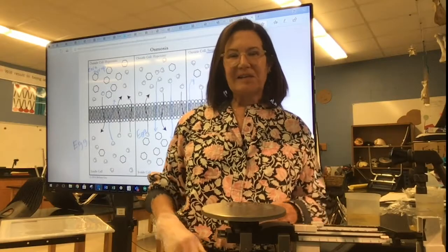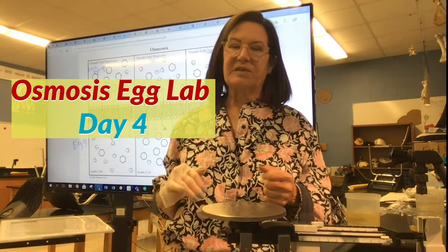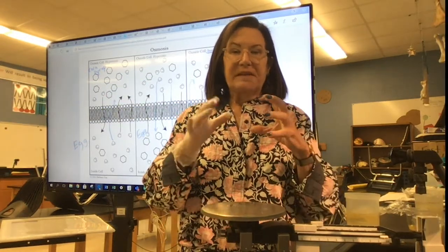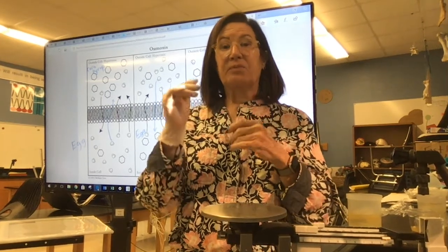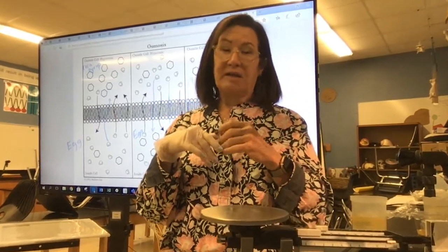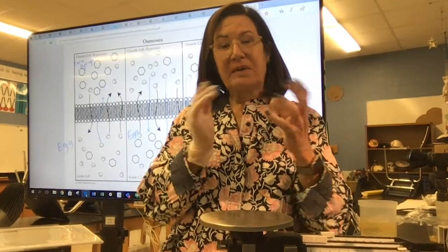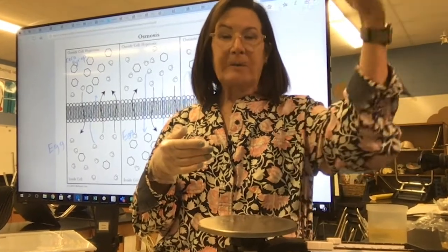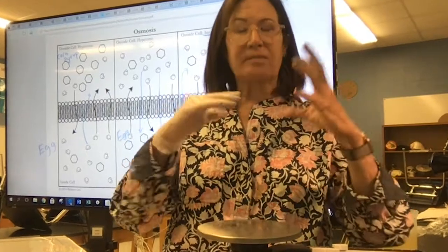Hey everybody, we're here for our final day of this Osmosis Egg Lab. And remember the first day we had the egg and it had its shell, and then we put it in vinegar, right, to dissolve that shell. And when we took it out, we noticed that water had gone into the cell. That cell got bigger. Remember, it actually weighed more.